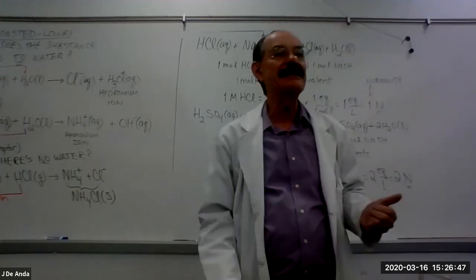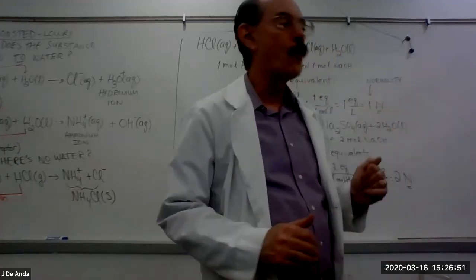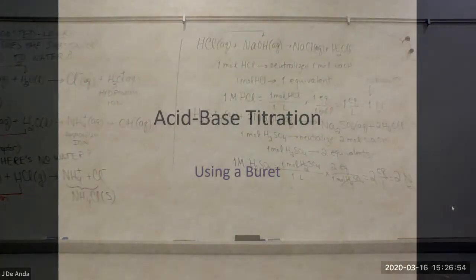And this is a technique called titration, all right?